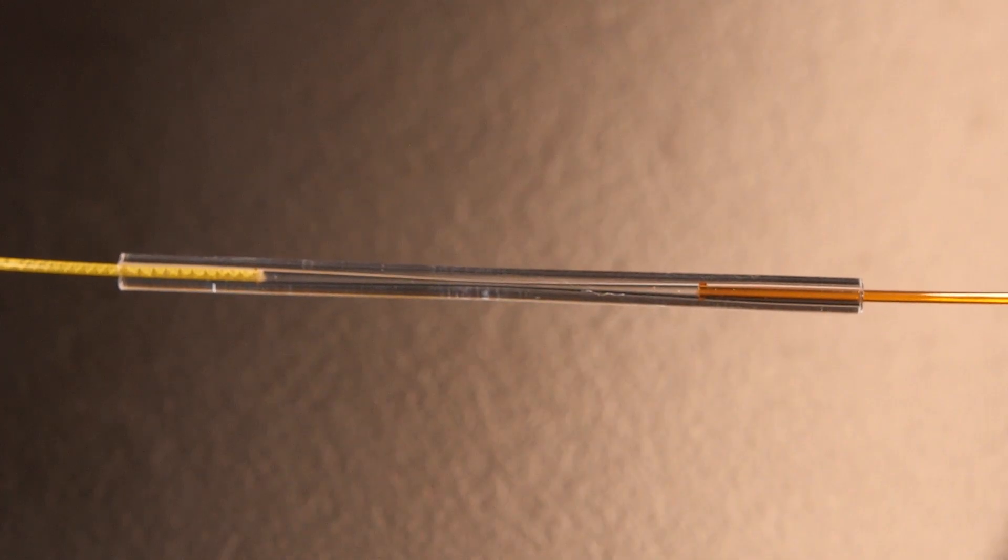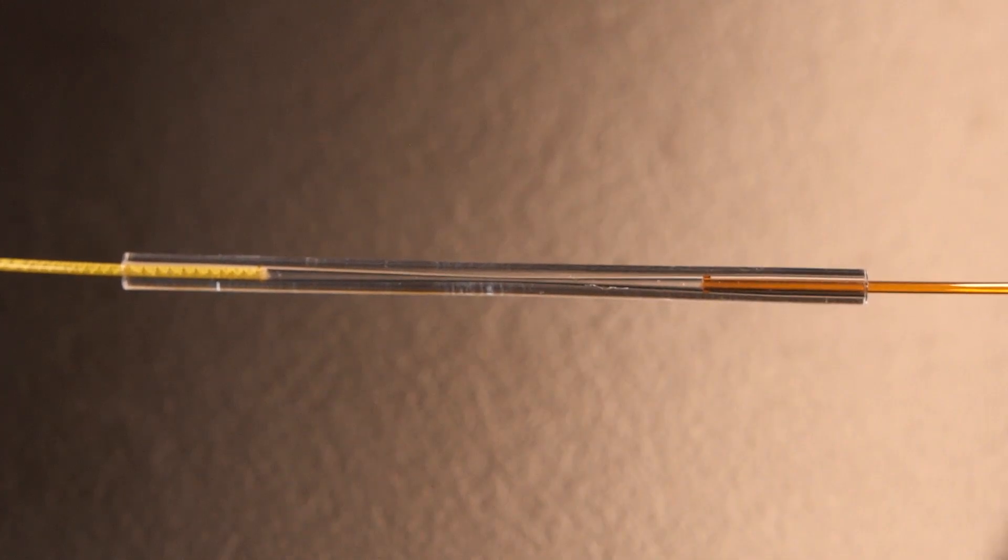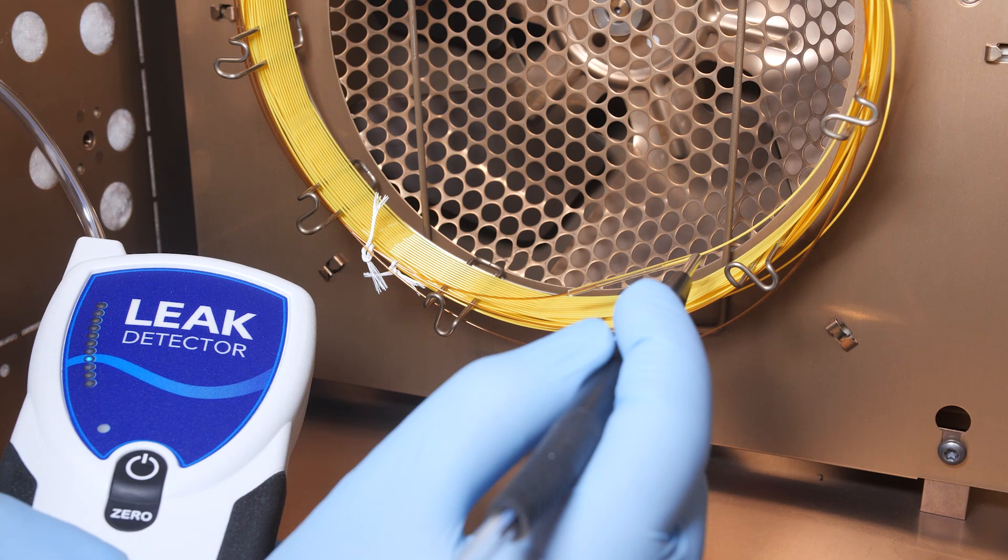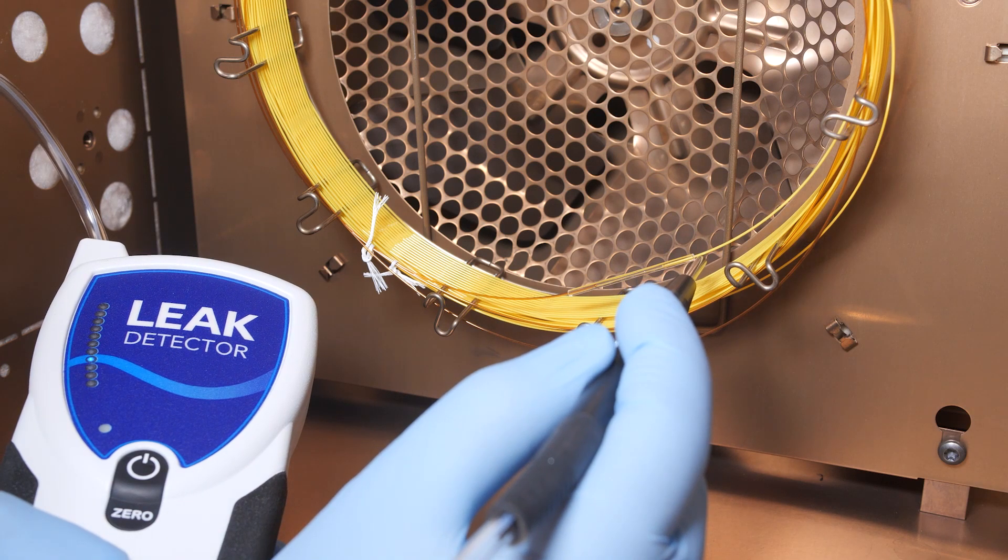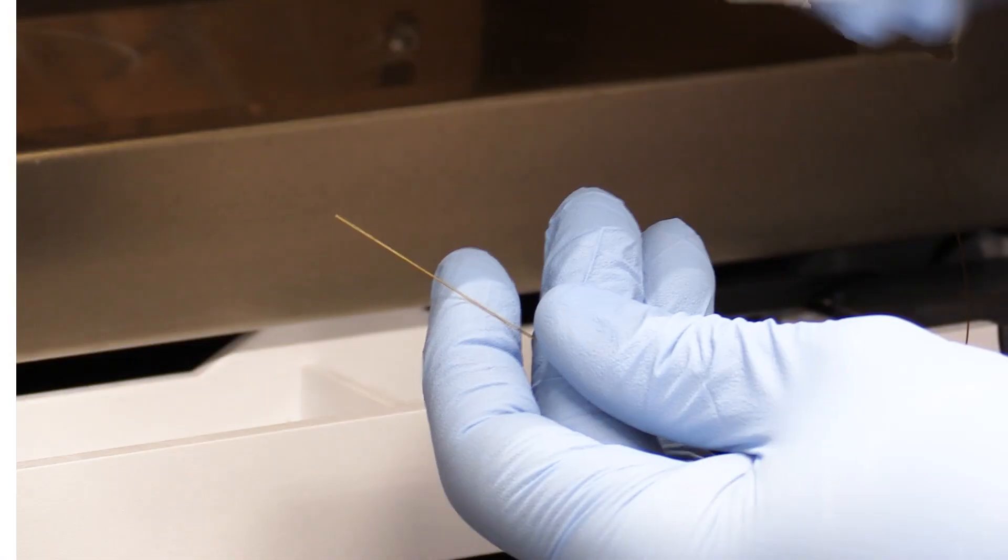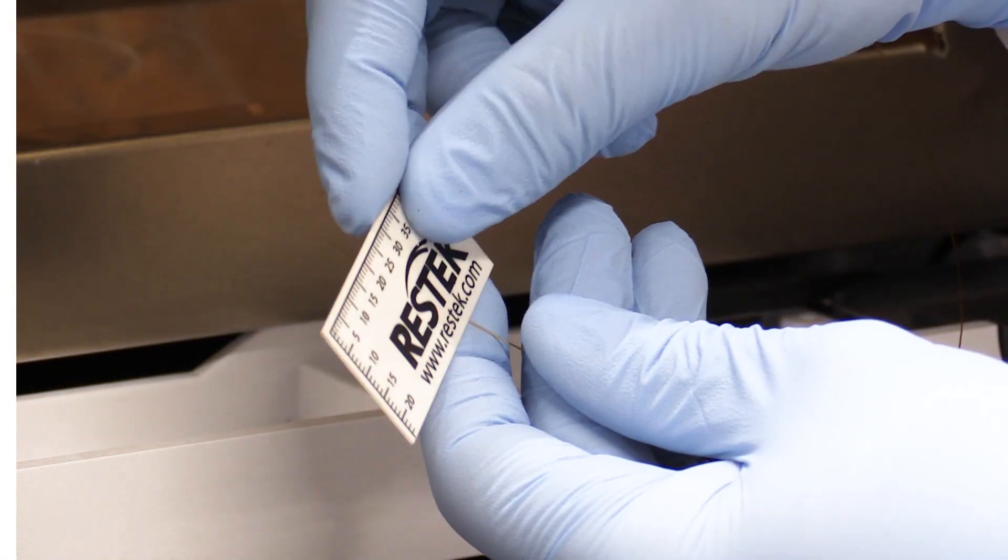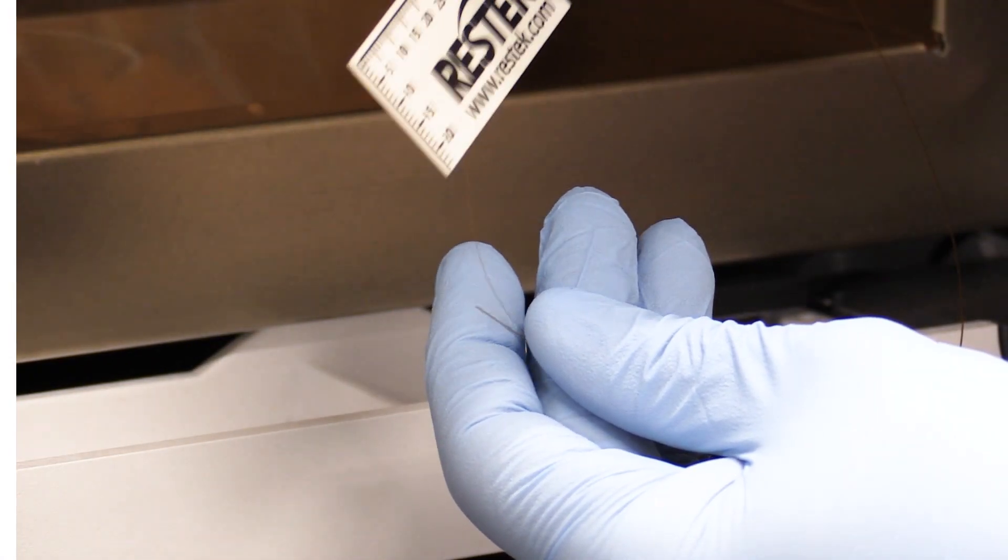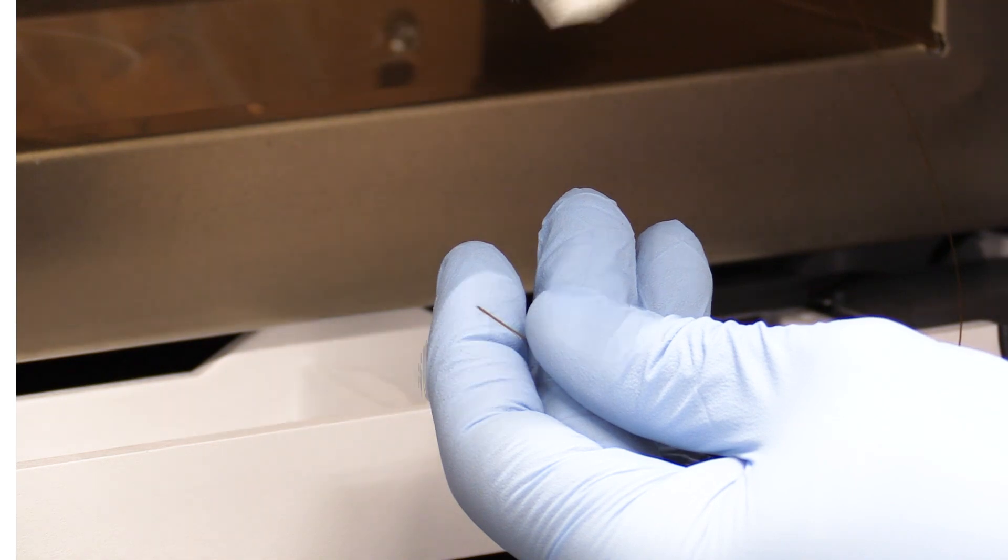Visually inspect both seals and leak check the connections using an electronic leak detector. If you notice a leak, cut a small portion of the column in question and reconnect.